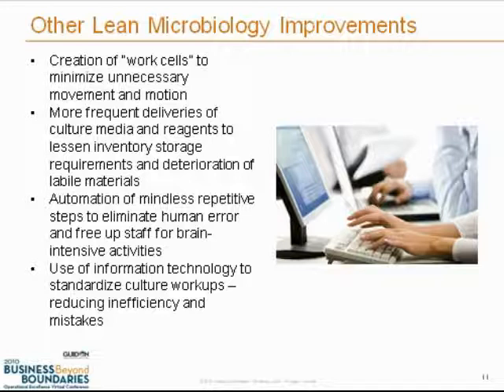And finally, the use of information technology, the laboratory information system in particular in this example, to standardize the culture workup, which reduces inefficiency and lessens the chance of mistakes being made if everyone is following the same standardized procedures.